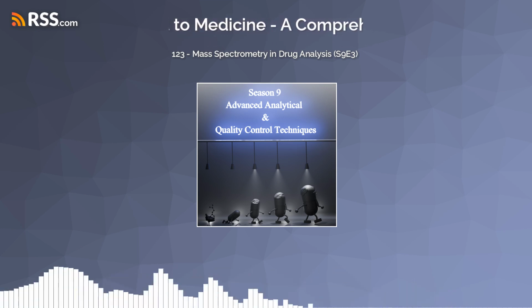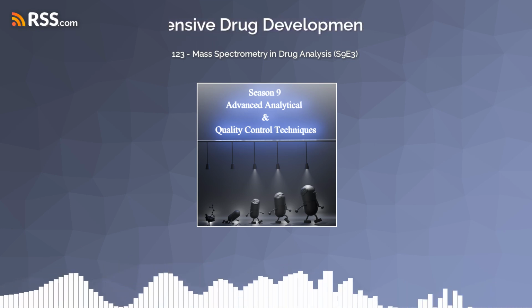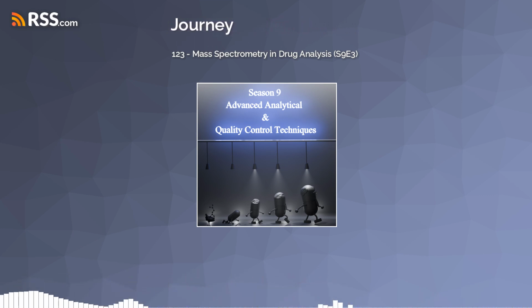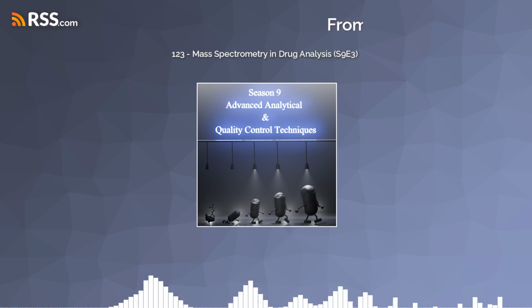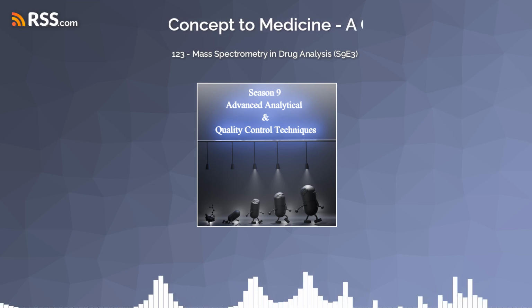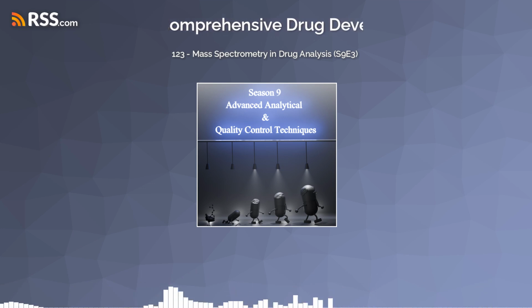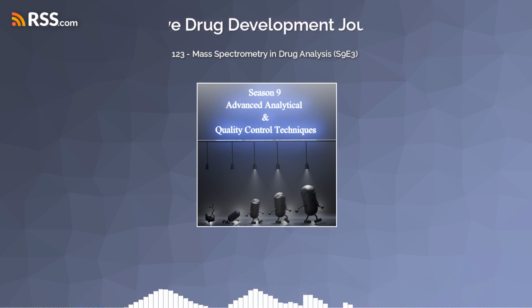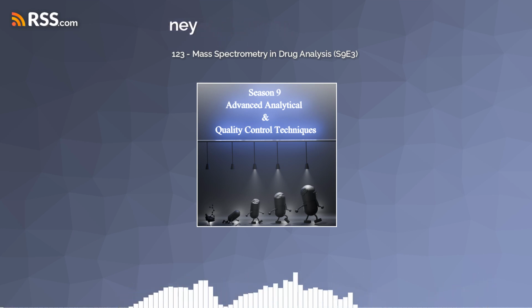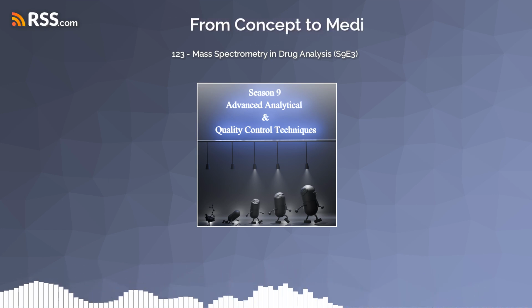So to sum up, mass spectrometry is way more than just a cool piece of equipment. It's like a molecular detective that's essential for making sure that the medications we use are safe and effective. It helps us see those tiny impurities that can have a big impact, helps us make sure drugs are made consistently, and it even helps discover new drugs. And it often teams up with other techniques like LC to get the job done. Exactly. We talked about how important resolution and sensitivity are and how the whole process is tightly regulated to ensure accuracy and reliability. It's amazing to think that we have this level of molecular detail available to us, isn't it?